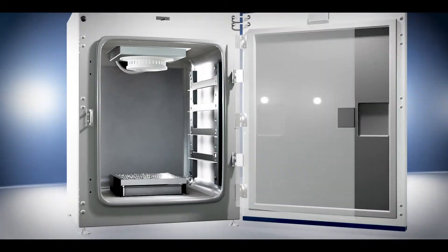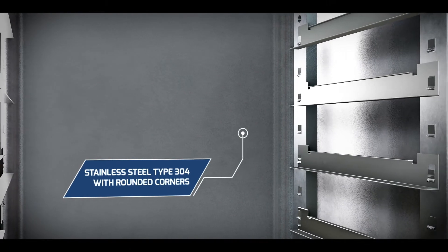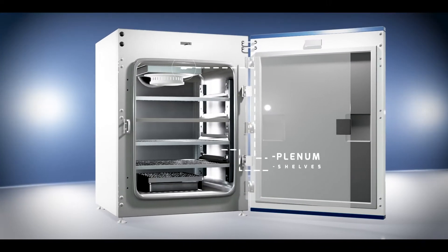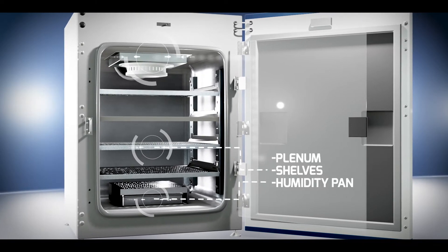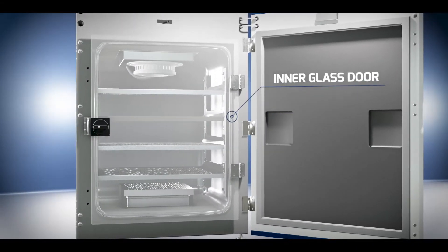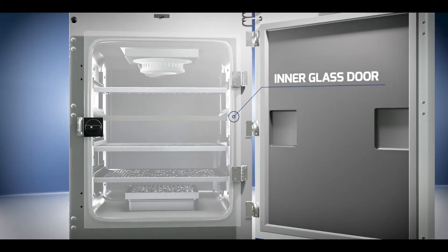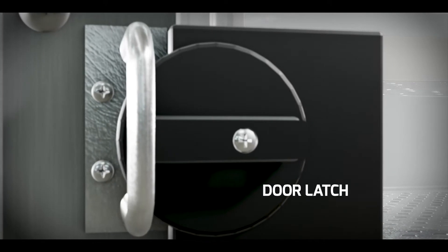The incubator chamber is stainless steel type 304 with rounded corners for easy cleaning. Its perforated plenum, shelves, and humidity pan are also made of stainless steel. An inner glass door is installed for observing sample cells inside the chamber during operation. Secure your samples with the door latch.